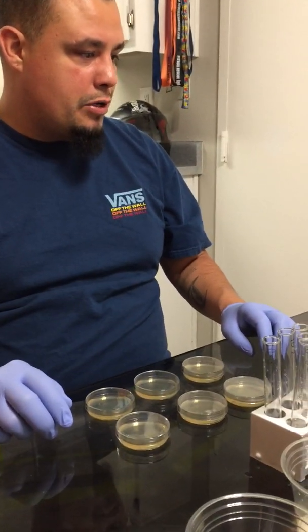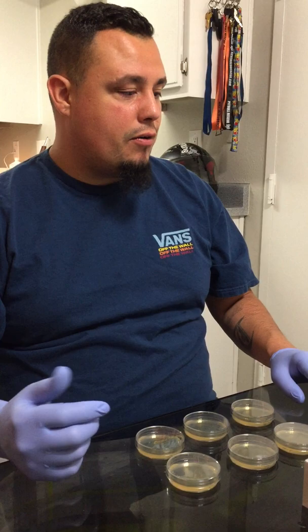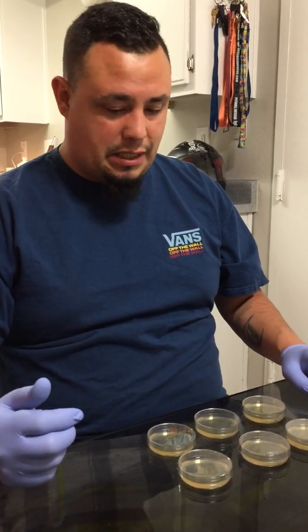I'm going to place the agar plates in our incubation location in my cabinet, with the lid side up for 12 hours to allow the liquid to be absorbed in the agar. After 12 hours, we will invert them and incubate for an additional 36 hours. So we're going to have these in the cabinet for the next few days.